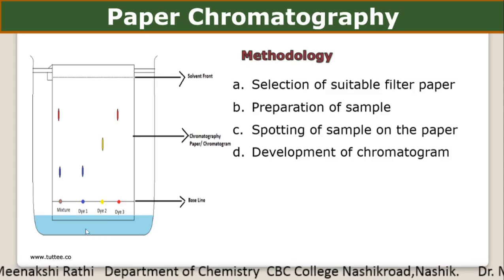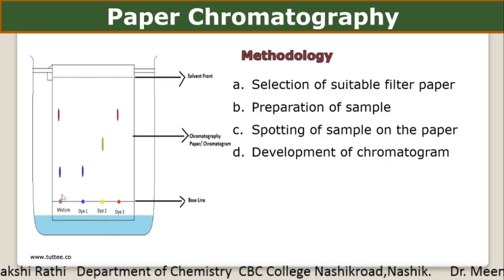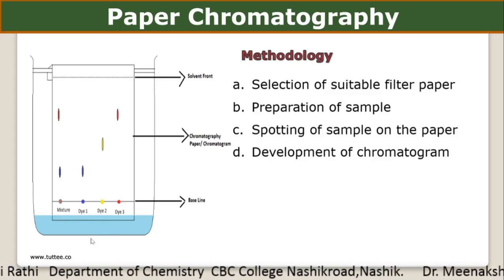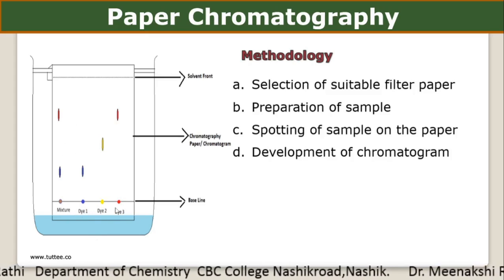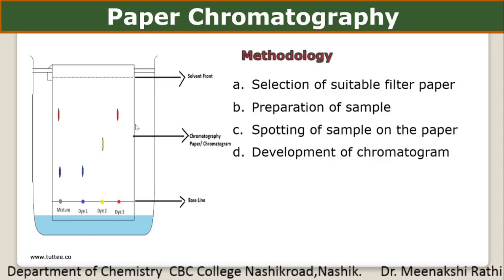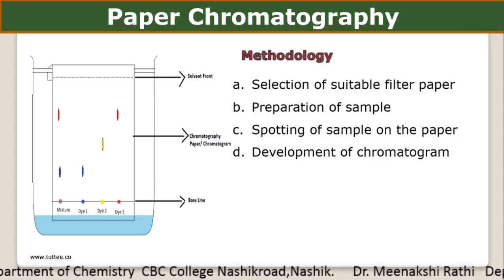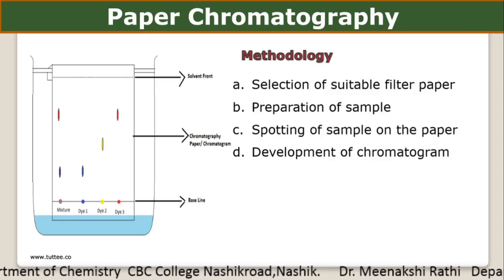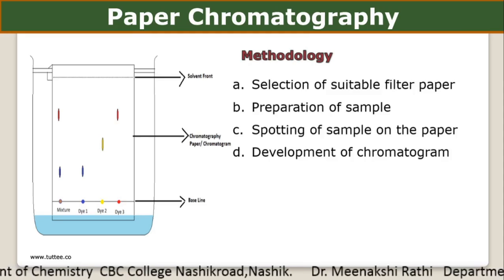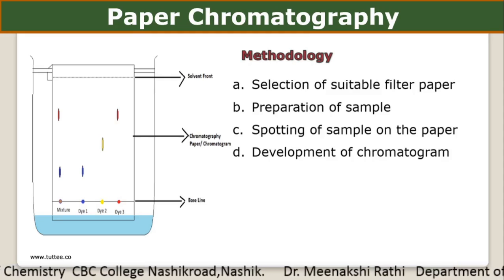Once this mobile phase starts running, it takes the mixture along with it. Once the mixture is running and the spots start running, once the development is done, the paper is held carefully at the border, so as to avoid touching the sample spot, and then dried using an air dryer.